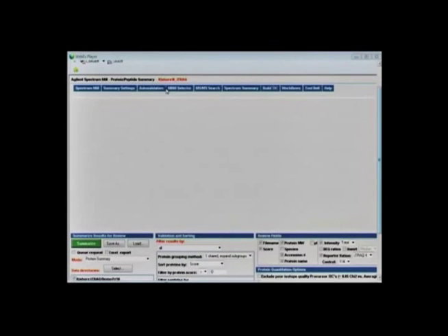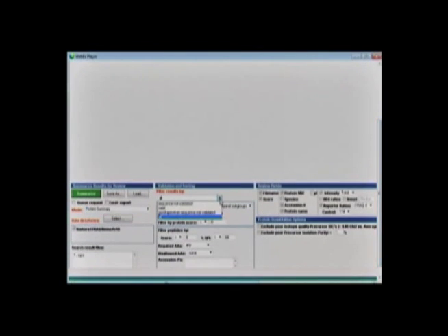Protein peptide summary is the tool to visualize the results obtained from the MS/MS analysis. In the Mode tab, we have different options to display the results. We need to assign a few parameters prior to displaying the results, such as keep valid in the Filter Results tab to display only the statistically significant protein list.